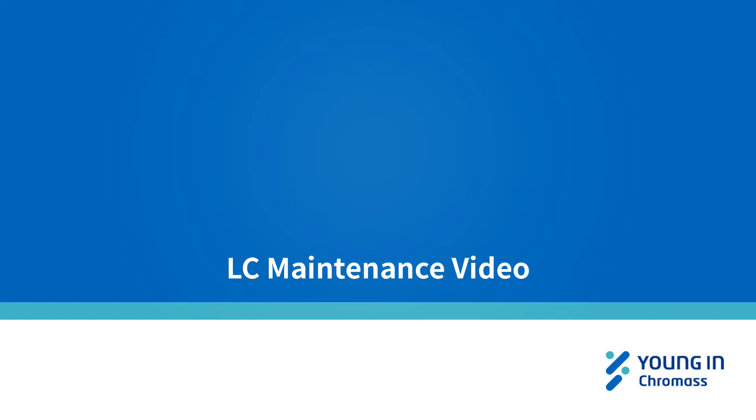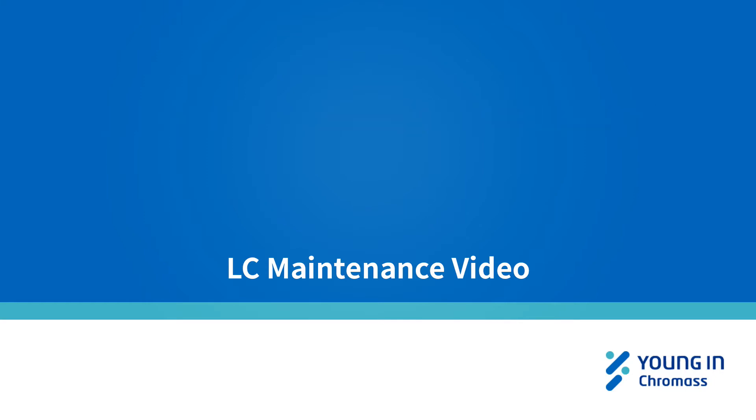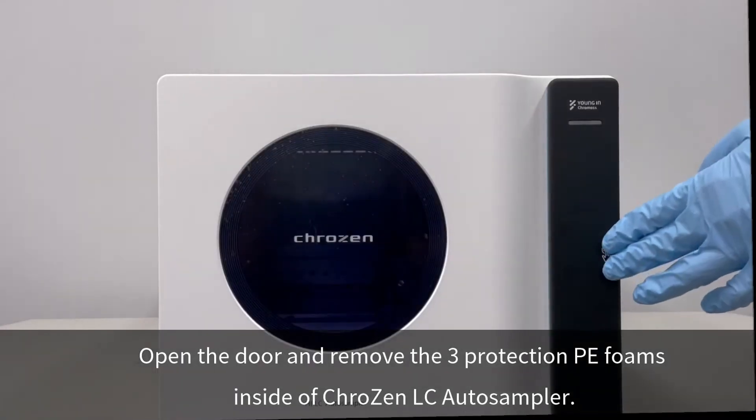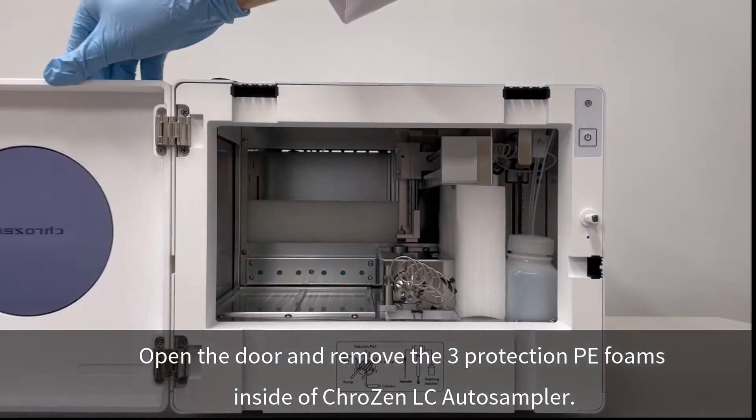This video describes how to align the Crozen HPLC Autosampler from the beginning of the installation. Open the door and remove the three protection PE foams inside the Crozen HPLC Autosampler.